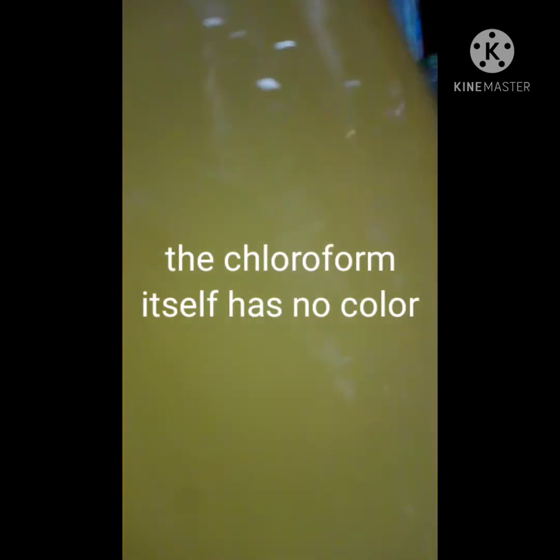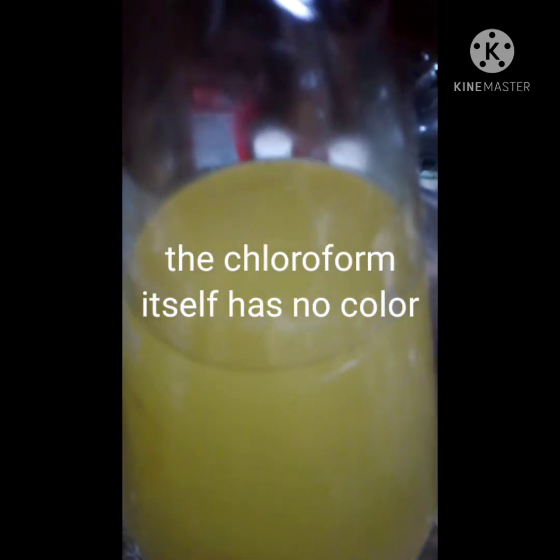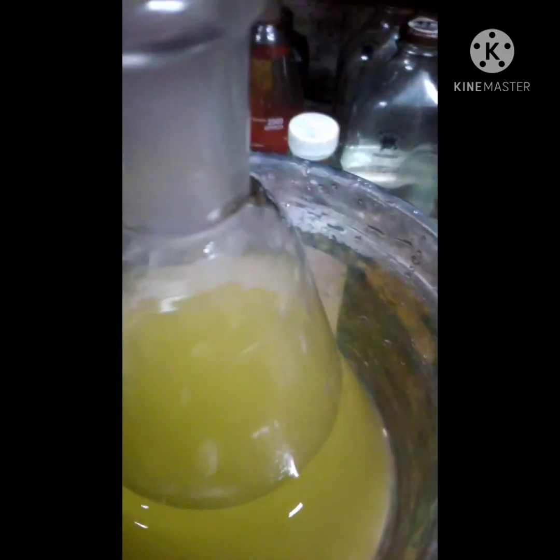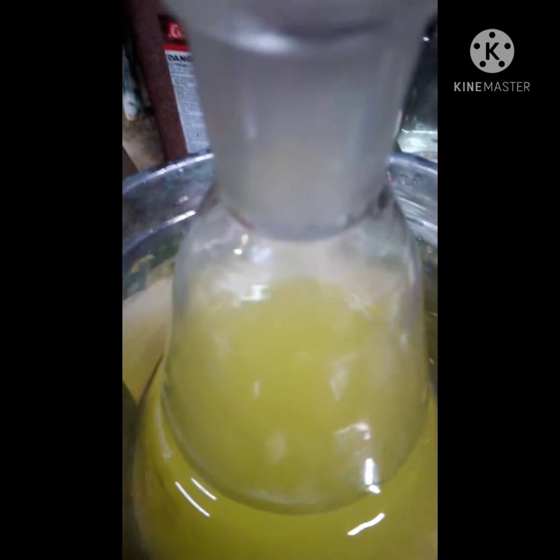You can see the liquid there in the bottom - that's my chloroform. Now I'm going to decant off the top liquid, get down to that bottom couple hundred milliliters, and put that into a separating funnel.